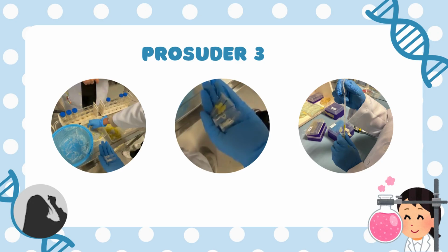Firstly, we prepare two separate sets of microcentrifuge tubes, each containing 3 tubes for a total of 6. Label each tube carefully using a permanent marker to ensure clear identification throughout the experiment. The first set will be labeled A1, B1, and C1, and the second set as A2, B2, and C2. Each letter A, B, C represents a different lipid-containing product that you have brought with you to the lab.